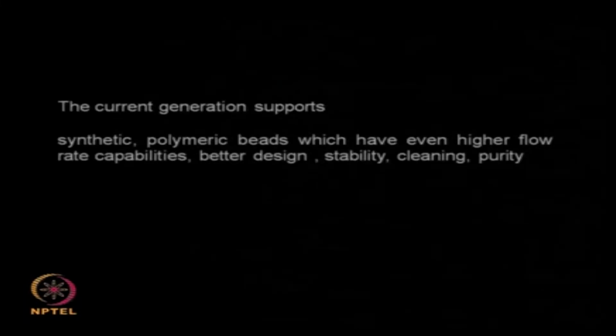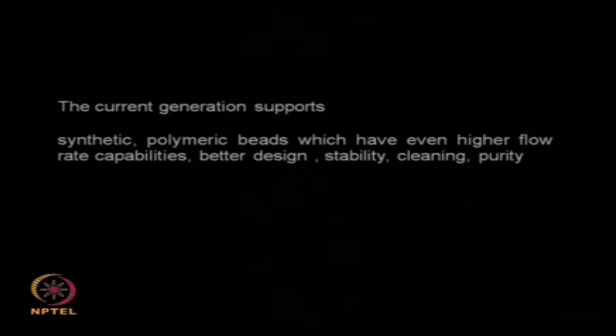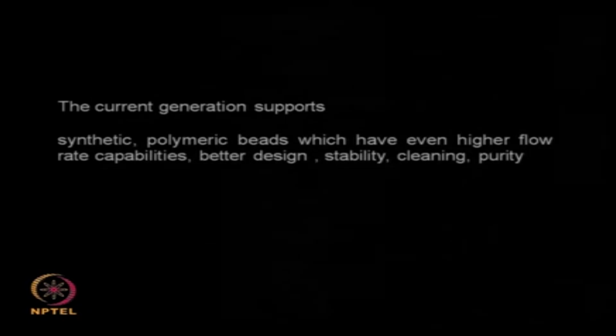Then as time moved on, they went into synthetic polymeric material, polystyrenes and different types of polymers, because we can achieve very high flow rate, we can have good design, stability, it is easy to clean, and we can achieve very high purity. So currently only polymeric stationary phases are used.